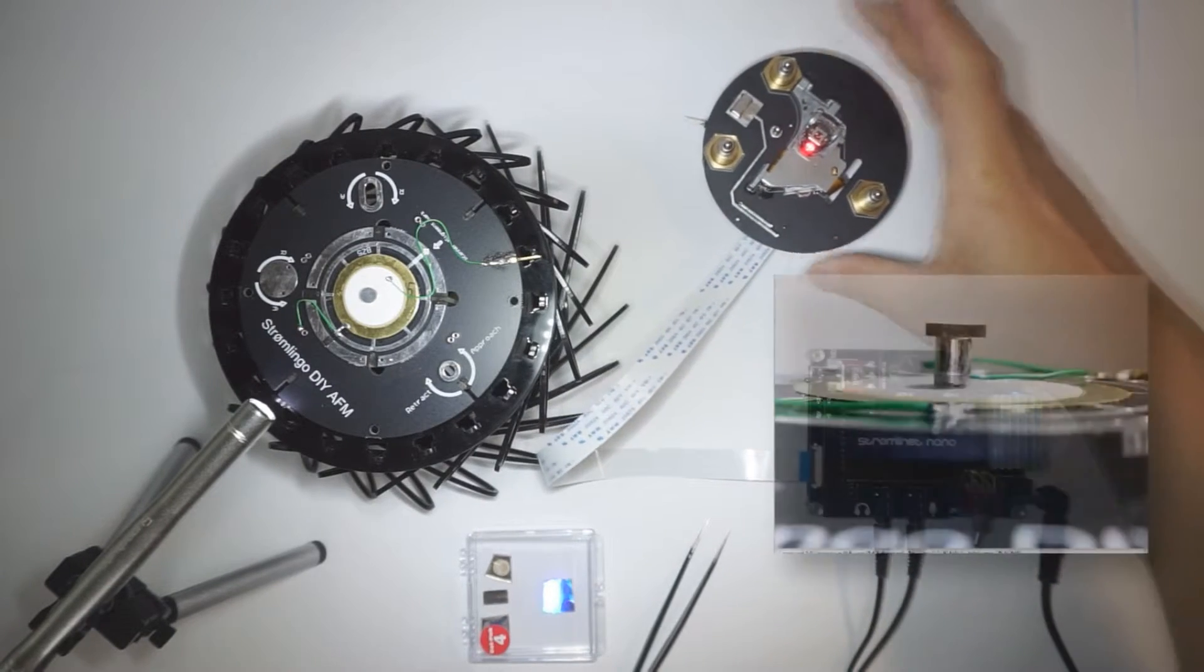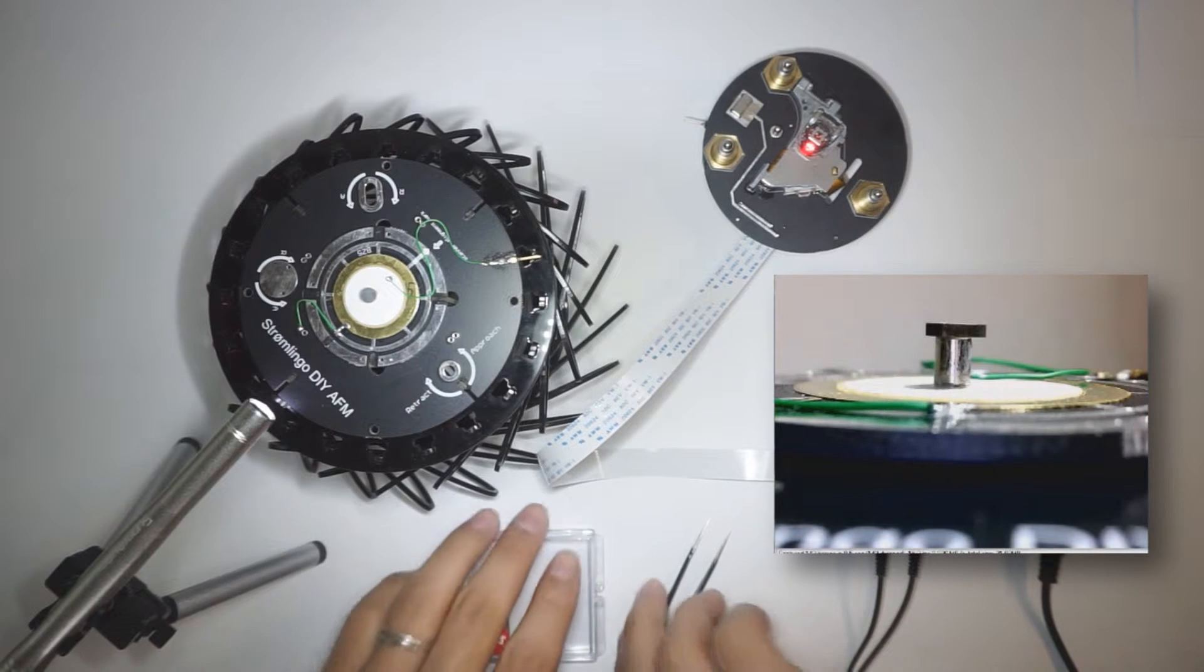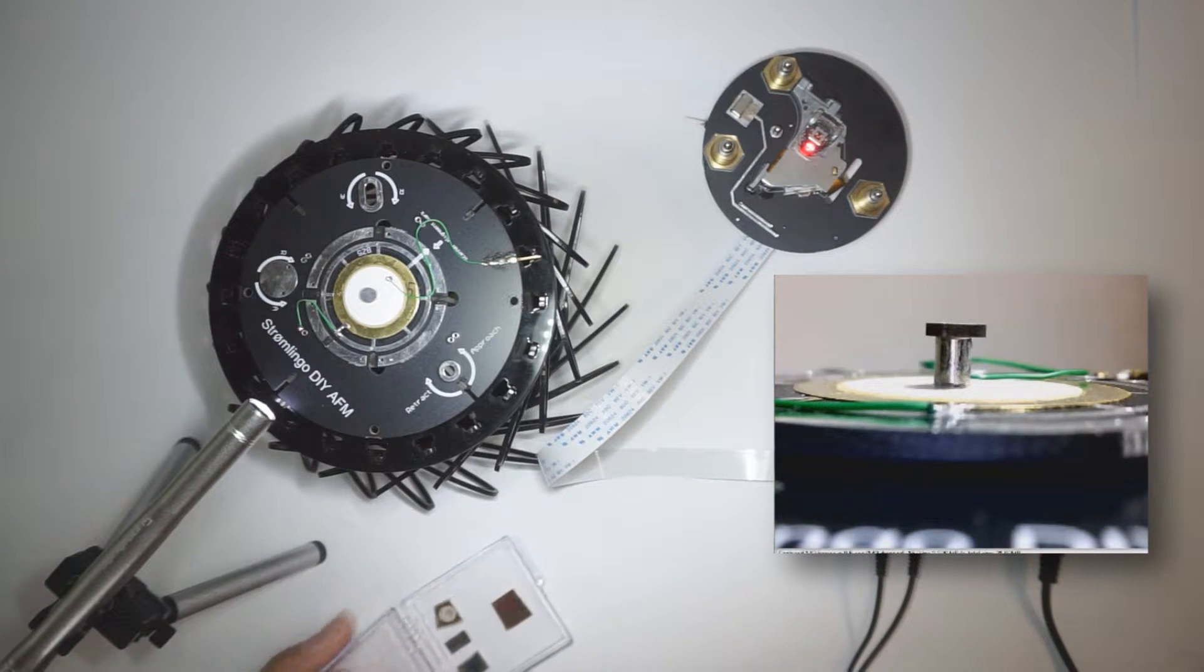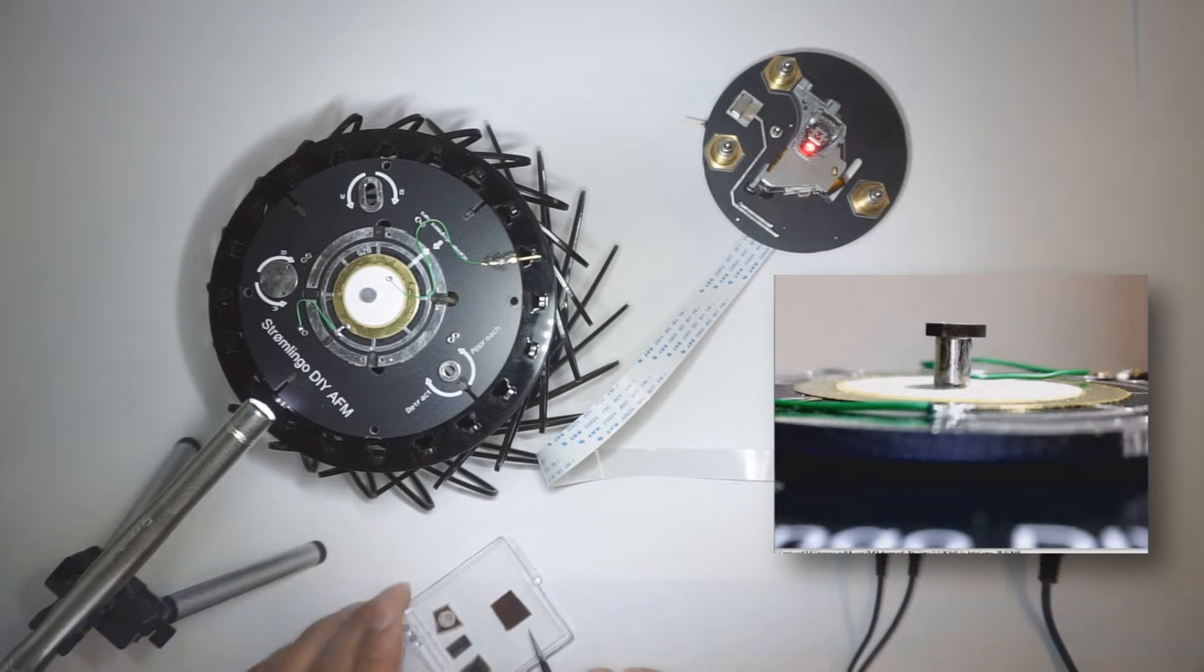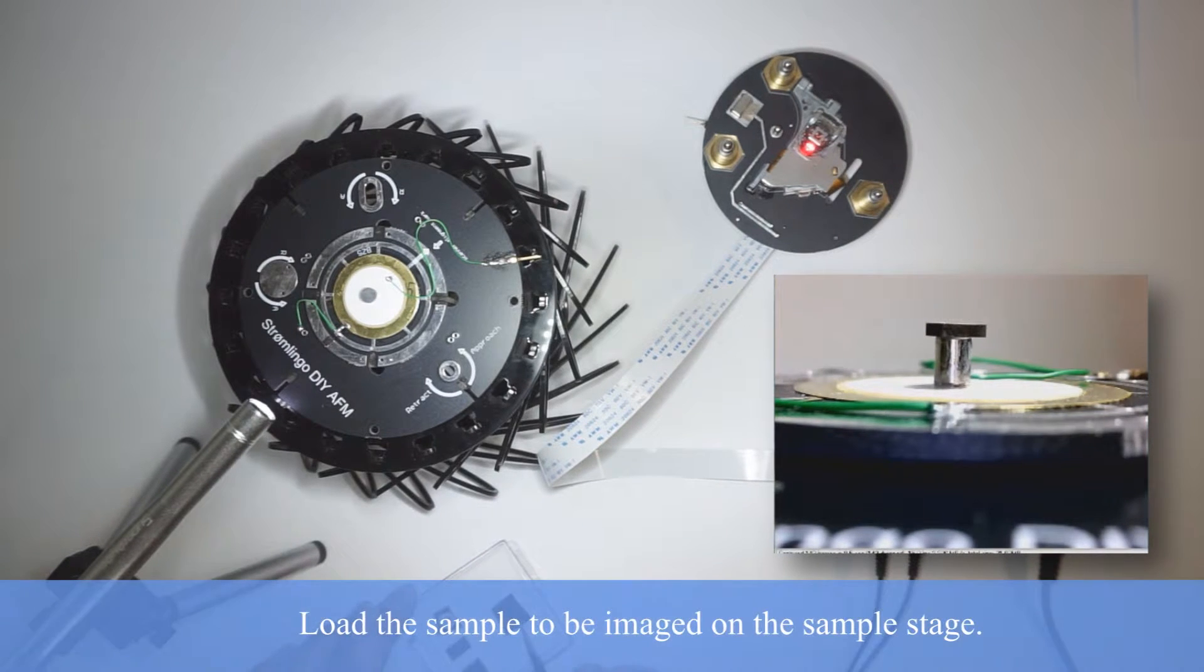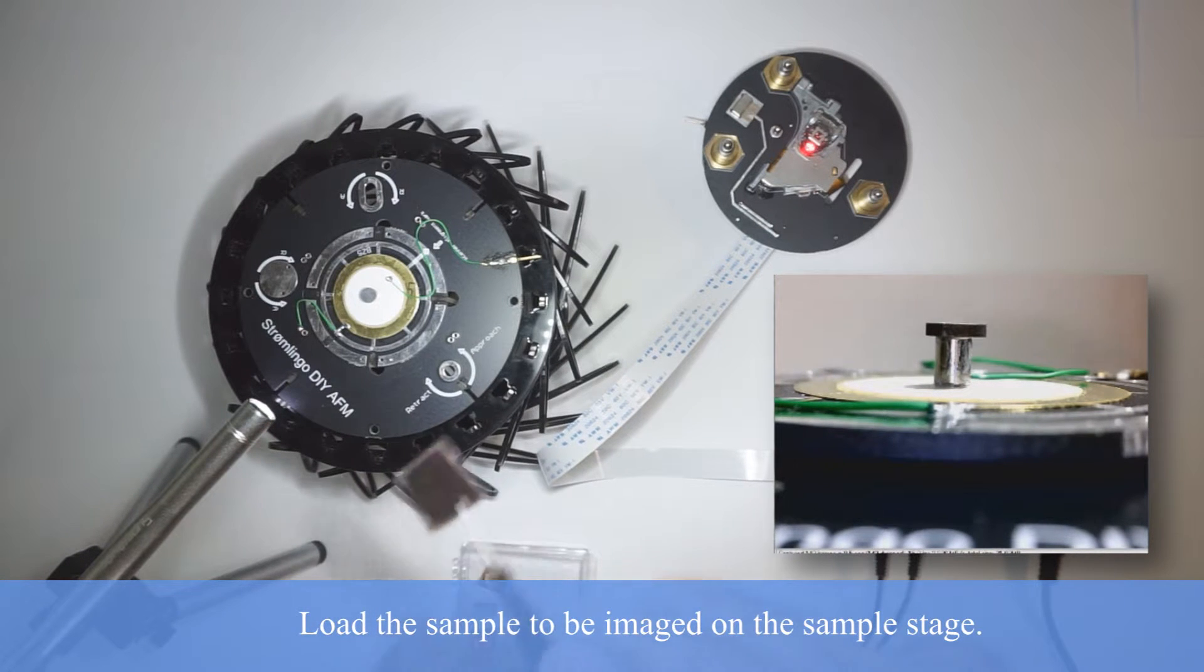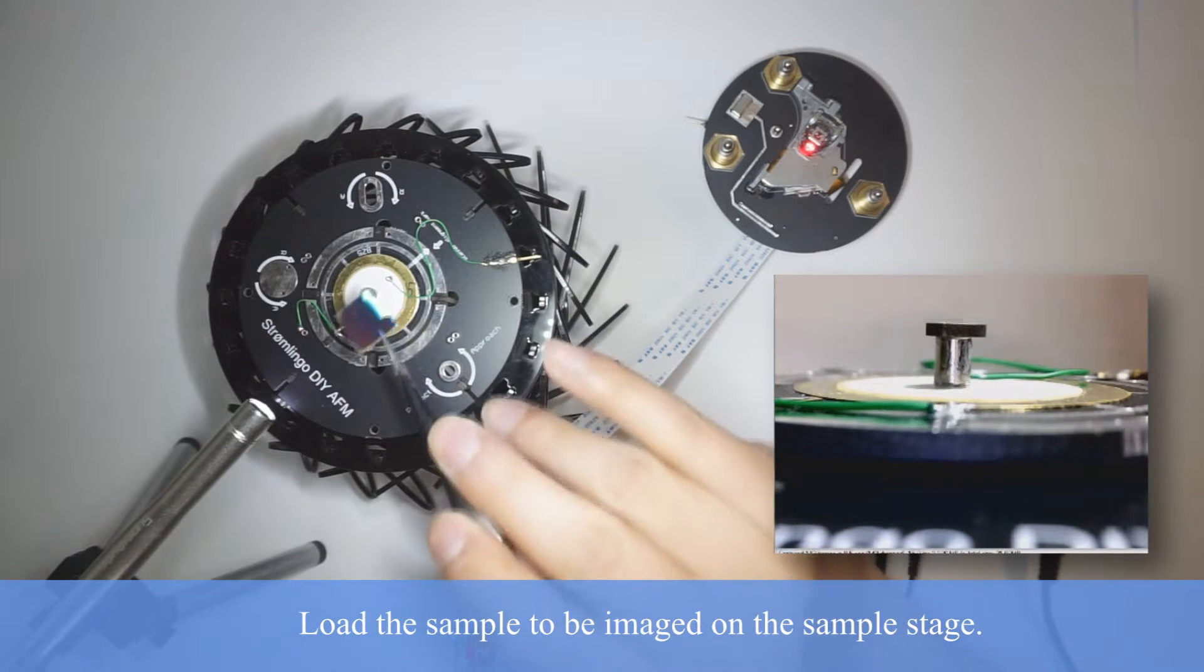Let's load a sample. Take some tweezers and grab, in this case, the DVD track sample, and load it onto the sample stage.